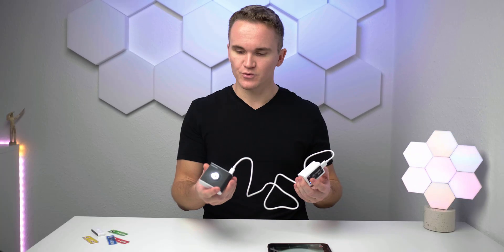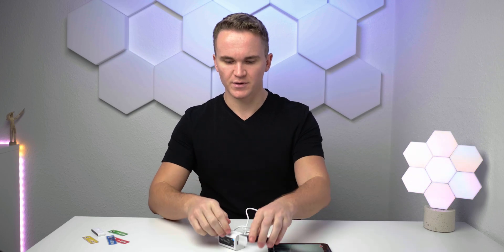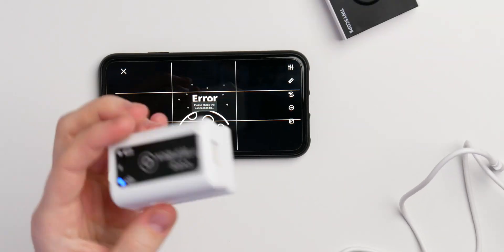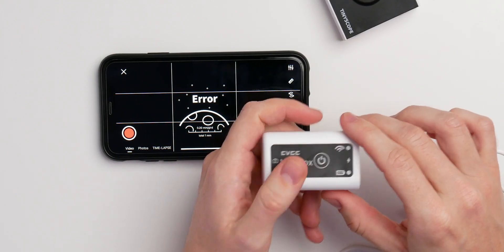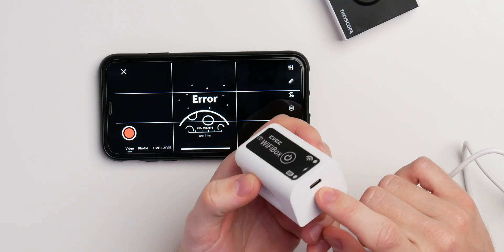And for something on the go and all the other probes and liquid samples you can use, in my opinion, really interesting product. Really tiny. It doesn't run on the battery. Inside here is basically not a lot, probably just the camera, a little PCB and the USB Type-C connector. It gets a little bit warm as well as this WiFi box here as well. You can just turn it off. Super simple and just charge it with USB Type-C.